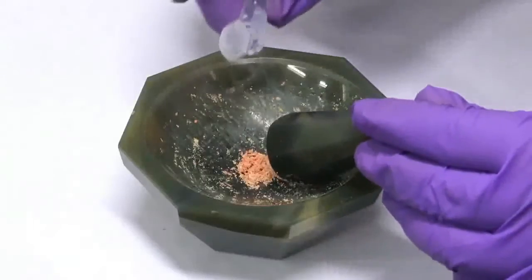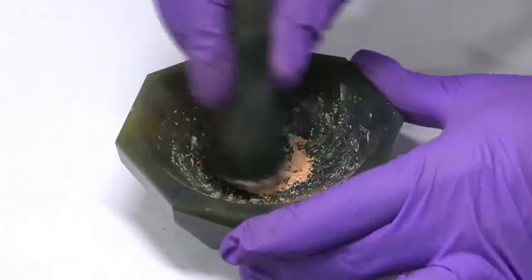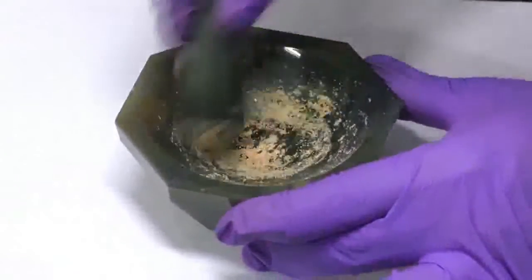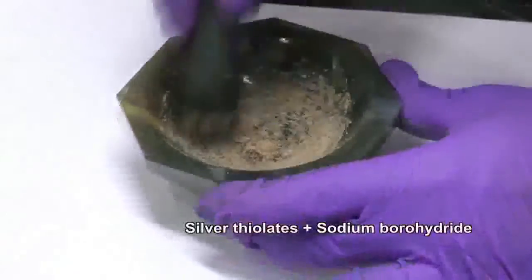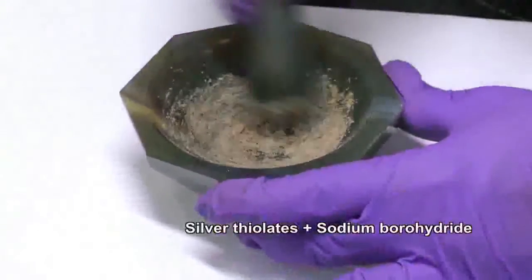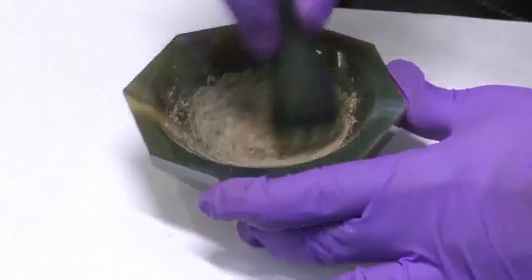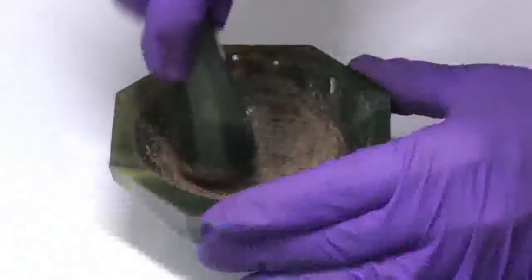Sodium borohydride was added next. Continued grinding results in a change in color from orange to dark brown. Silver thiolates got transformed to nanoclusters. This happened in the solid state.